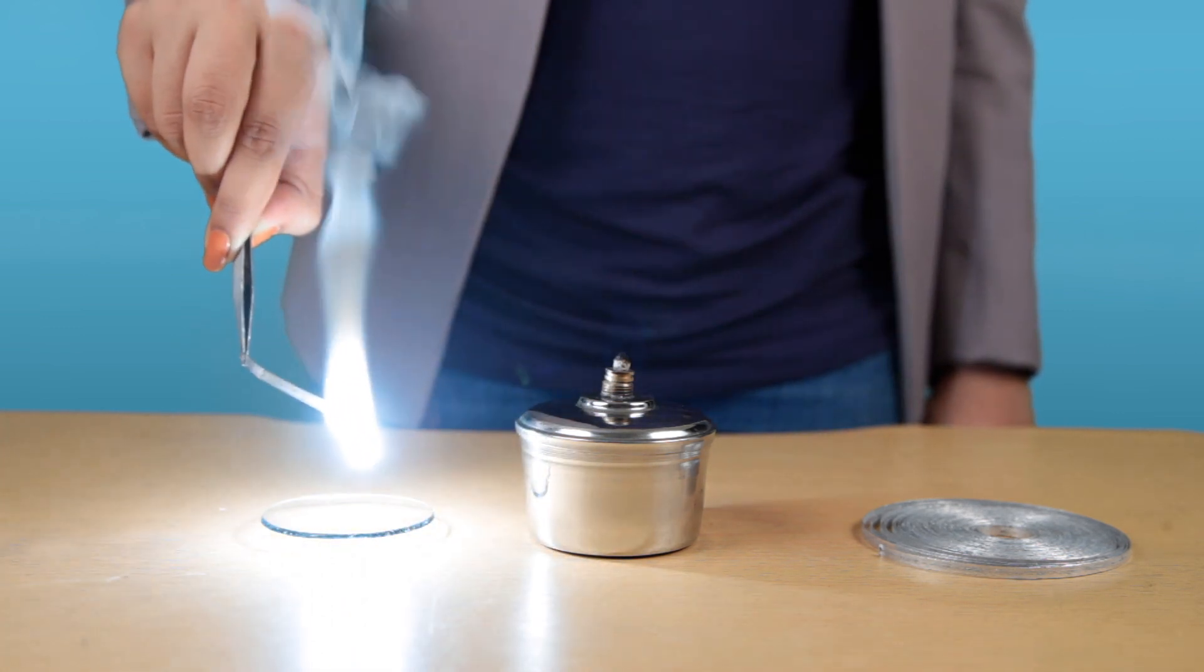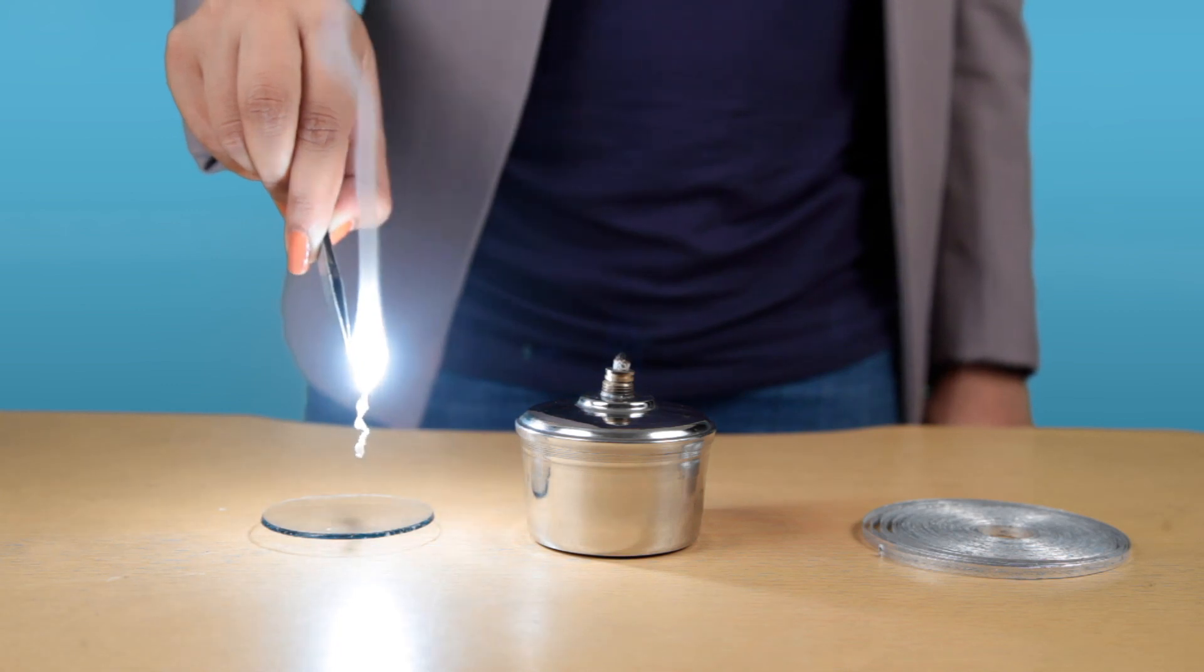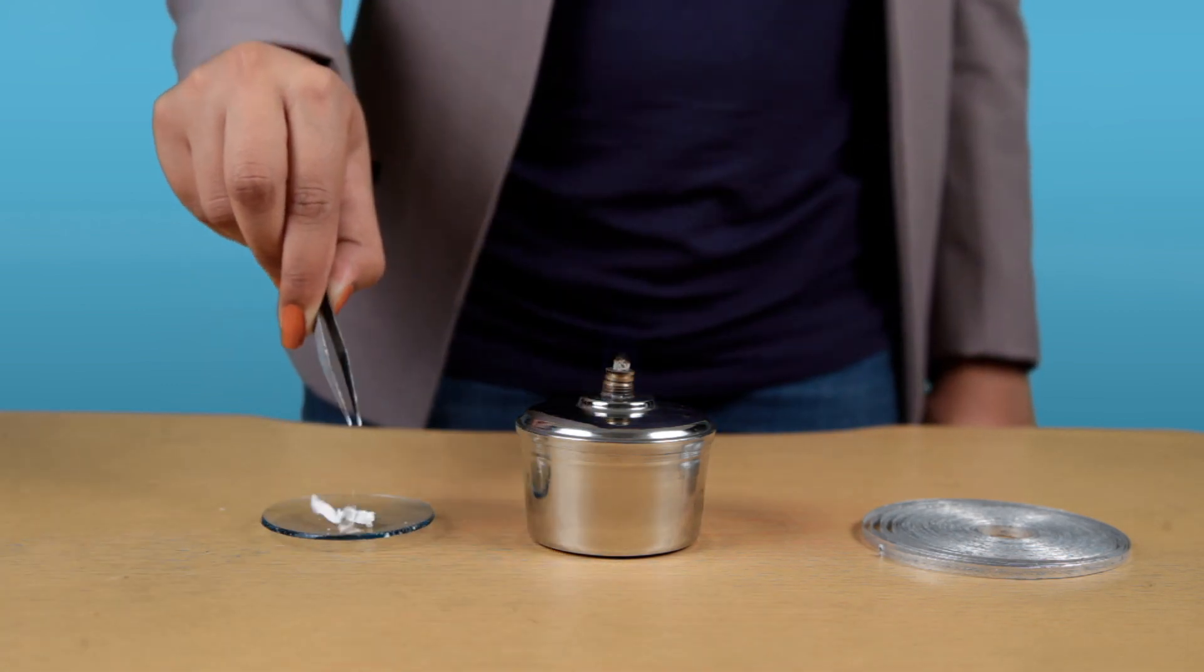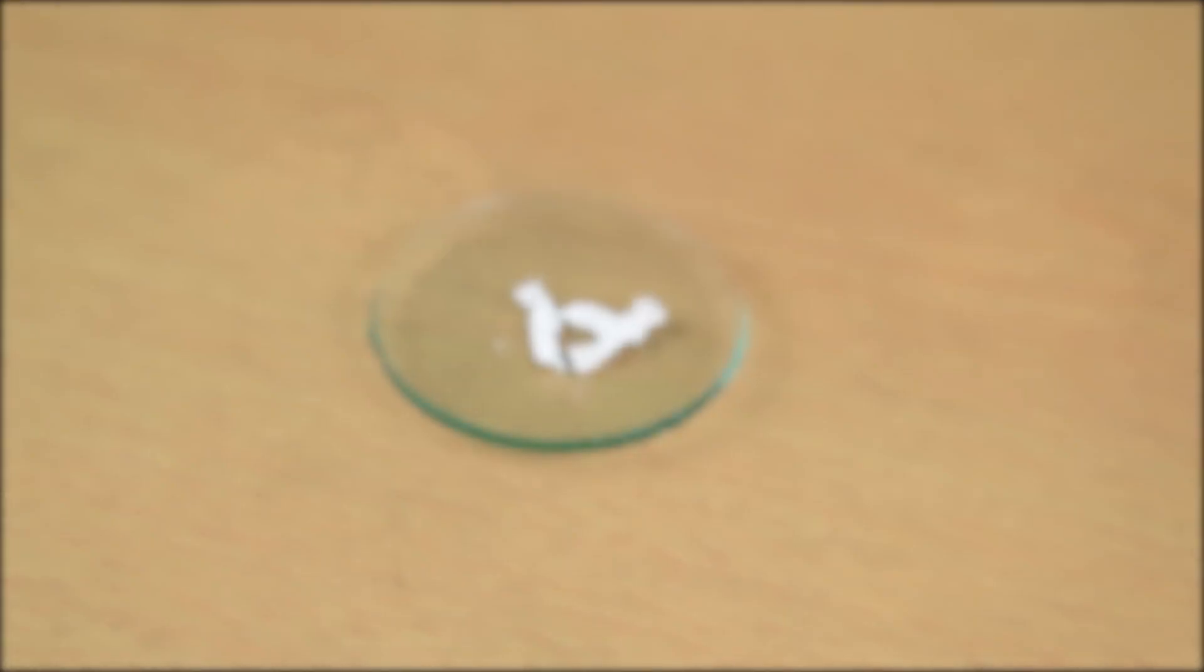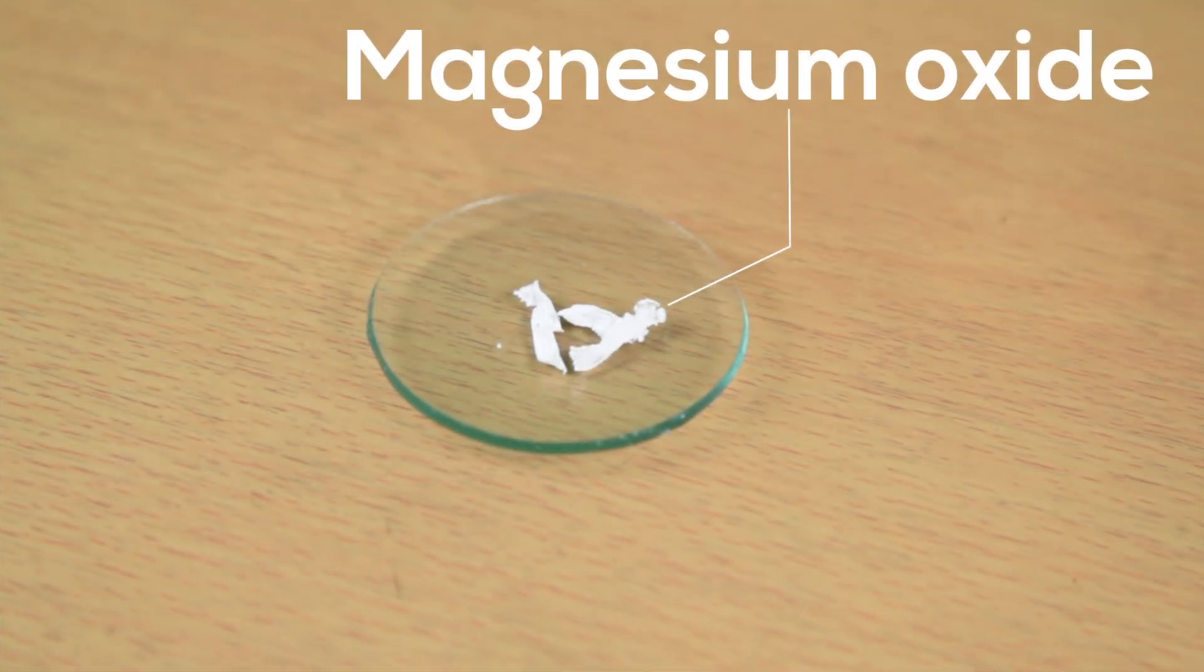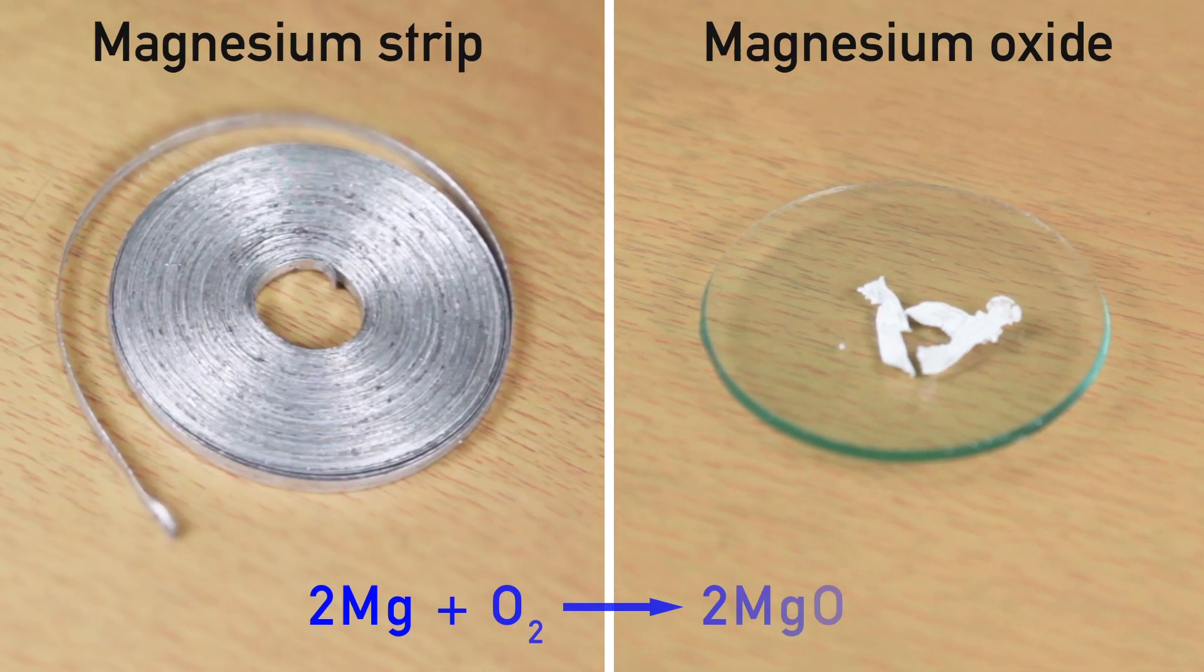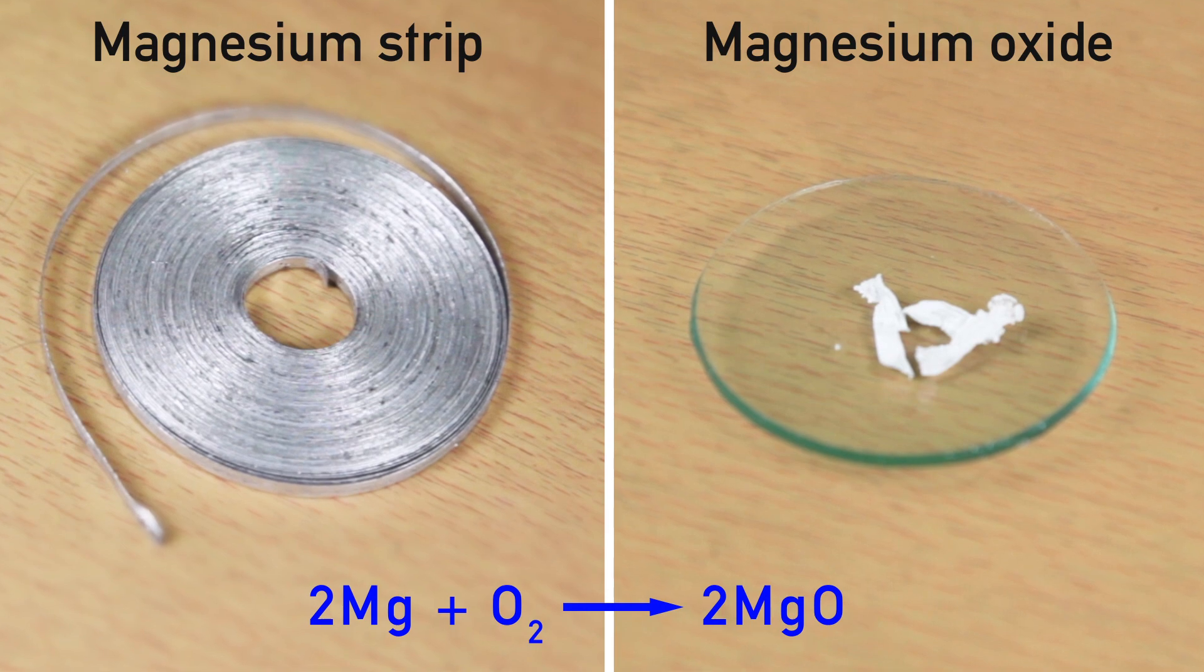We can observe that magnesium ribbon burns with a dazzling white flame and what remains at last is a white powder in a watch glass which is nothing but magnesium oxide. This burning of magnesium strip is actually a chemical change from magnesium to magnesium oxide.